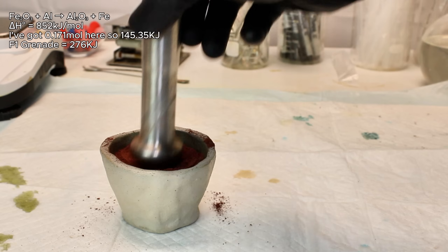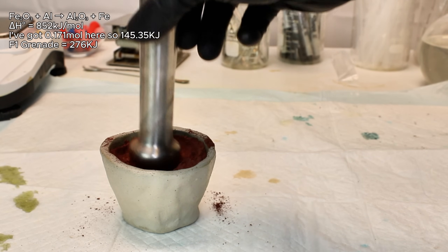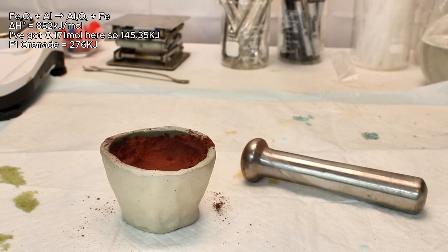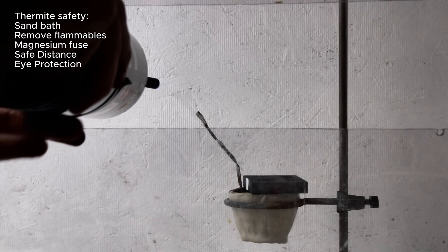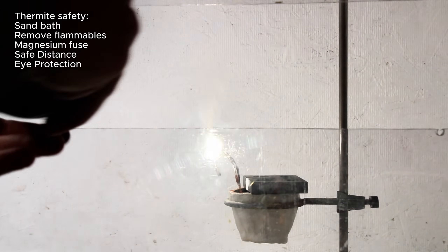An F1 grenade releases 276 kilojoules of energy for reference. That said, this reaction can be very dangerous, and before even starting it, I cleared my fume hood and everything around it of any flammables and suspended my little crucible of thermite over a sand bath before covering most of the opening with a graphite plate. I then initiated the reaction using a strip of magnesium as a fuse, and this was by far the fastest thermite reaction I've ever seen, which was likely due to the extremely fine particle size of the iron oxide.